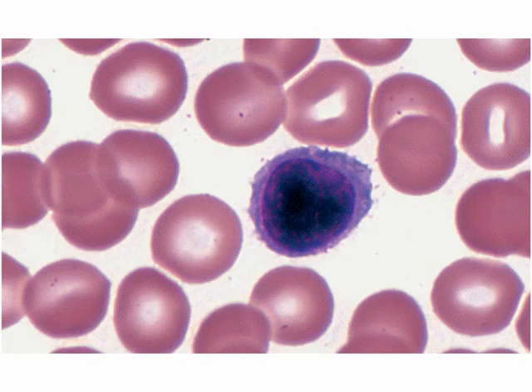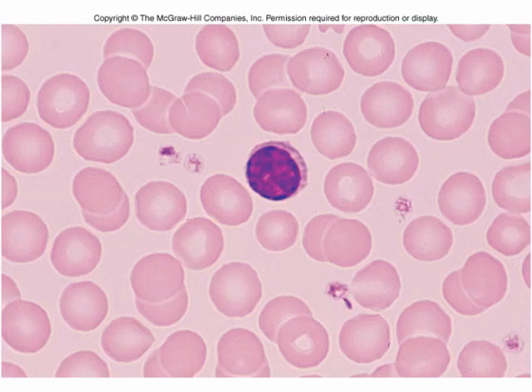All right, this next slide shows a real close-up view of the oil immersion of a lymphocyte. You can see that its nucleus is about the size of a red blood cell, the entire red blood cell. It's the smallest of all the white blood cells. The monocyte is the largest, the lymphocyte is the smallest, and it has a bluish colored cytoplasm like the monocyte does. Not granular cytoplasm, just sort of a smooth blue.